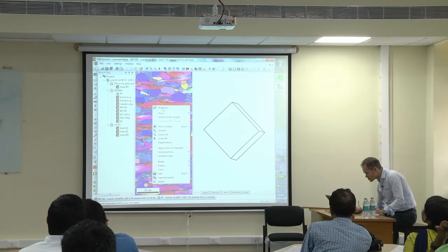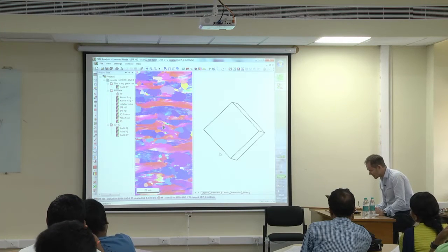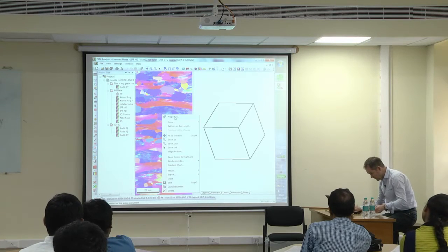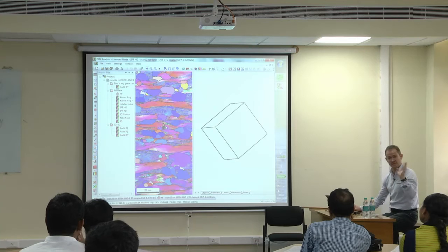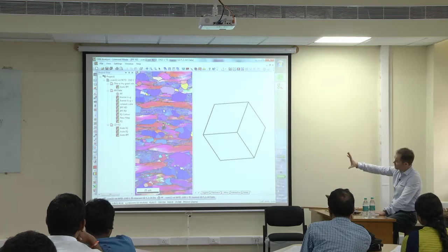And let's also show for a moment no boundaries. It looks a bit more beautiful for the beginning. All right, good. So now we want, sorry, one more thing. Show boundaries was good, but I showed too many small grain boundaries. We need to speak about grain boundaries later and about misorientations. Almost very important, but not for this one here yet.